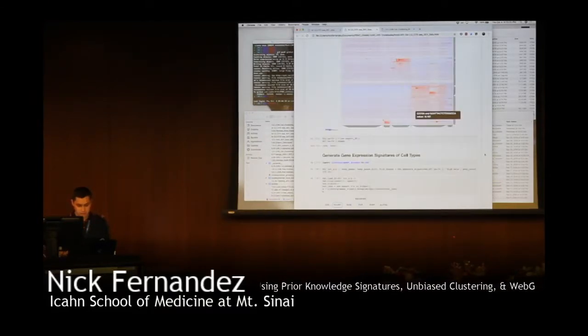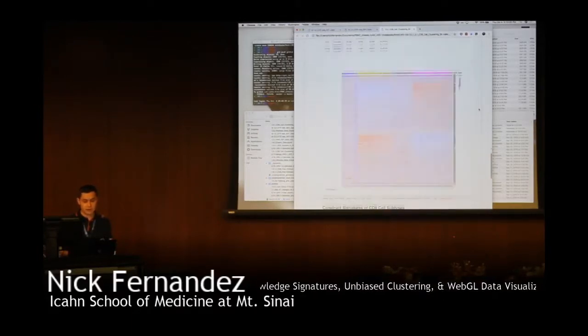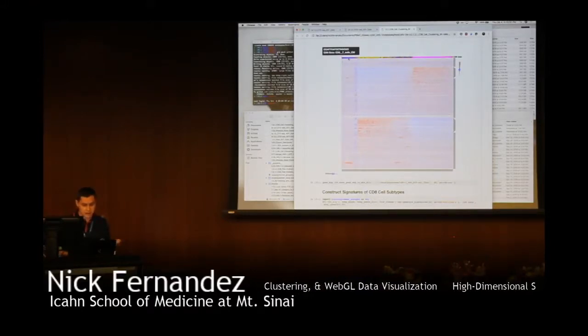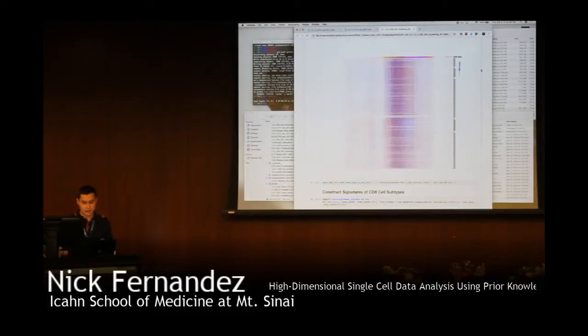Yeah, and then one other small thing, if we can zoom into CD8 clusters, and we can look at subtypes of CD8s here. So here we've got naive CD8s over here, and then CM CD8s over here, and we can see that we're getting clustering of CD8s by their subtype also. So it gets us down even to lower level granularity, and then we can reorder, and just see what's happening.